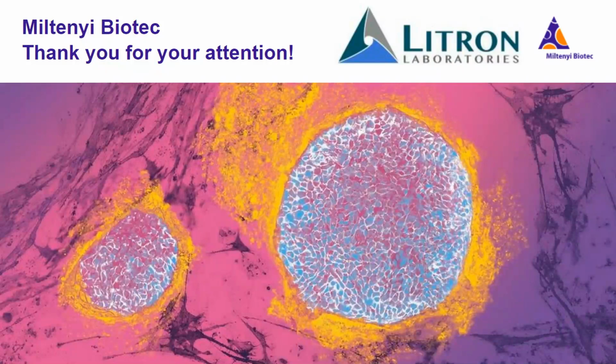Awesome, thank you. How does the cell counting on the MACSQuant work? Yeah, I was talking a little bit about the counting beads before. I'm not sure if I went into too much detail about that, but counting beads are a hard control that you would add to your sample to help qualify the number of cells in there.